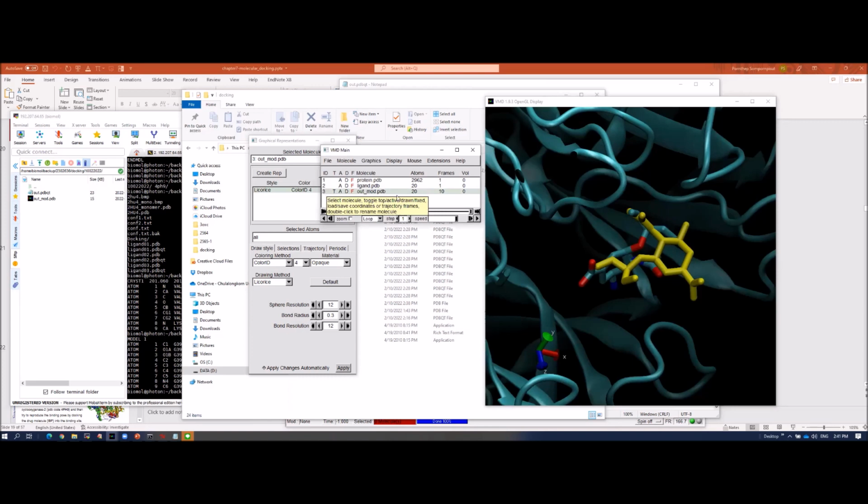In this object tree, you see the docking poses, the binding poses of the ligand, and we have 10 frames. That means we have 10 binding poses for the ligand here. This one shows you the last frame. If you want to check the other frames, you just load them, go back and compare.